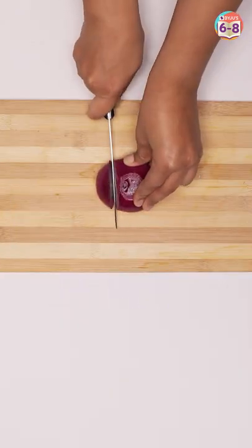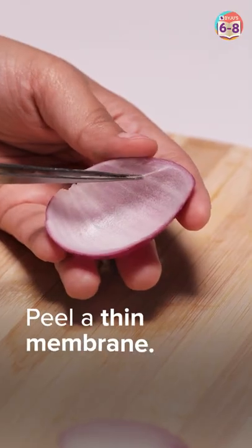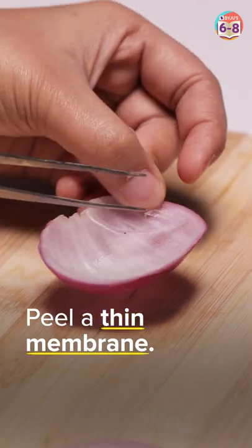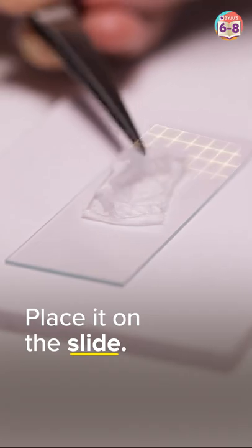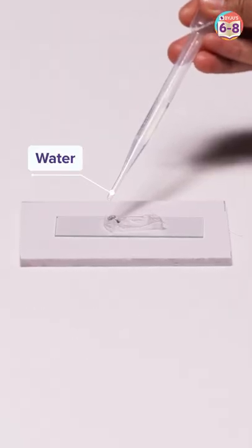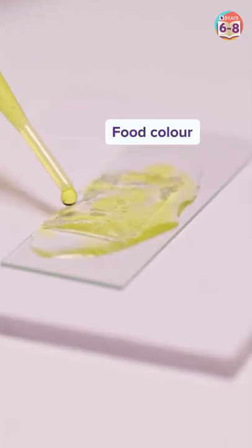First, we chop the onion. Then, let's gently peel a thin membrane of the onion shell. Now, place the membrane on a microscope slide and add a few drops of water, followed by a few drops of food colour.